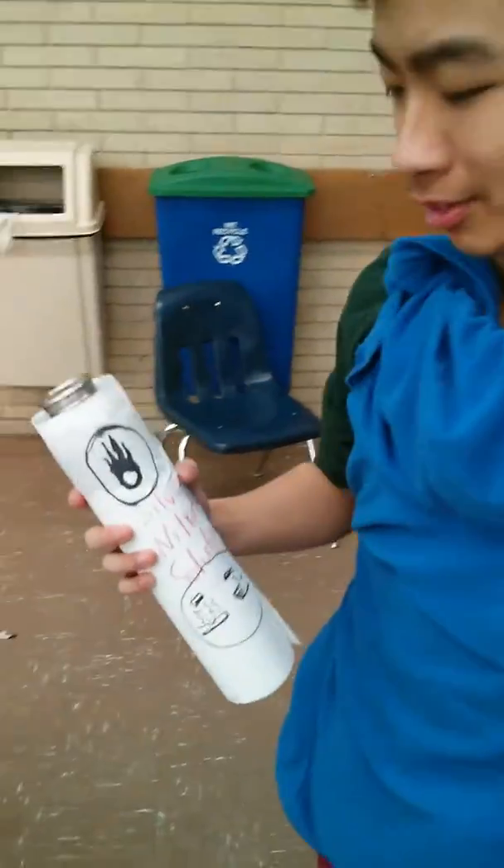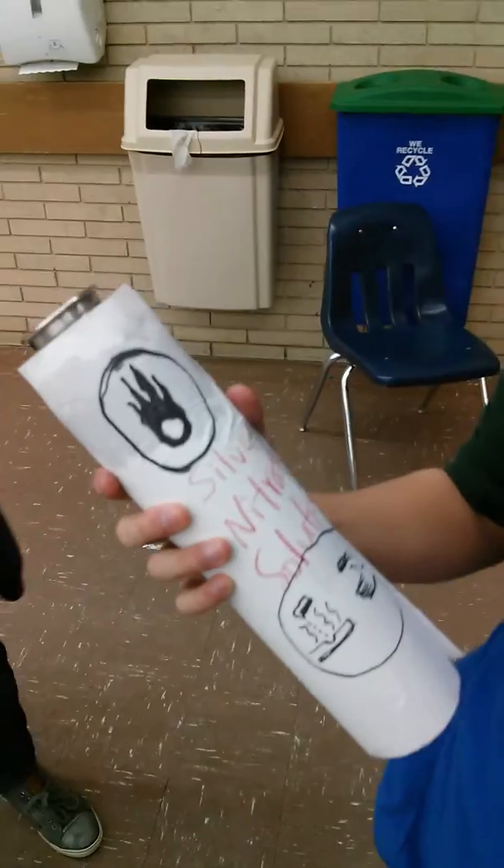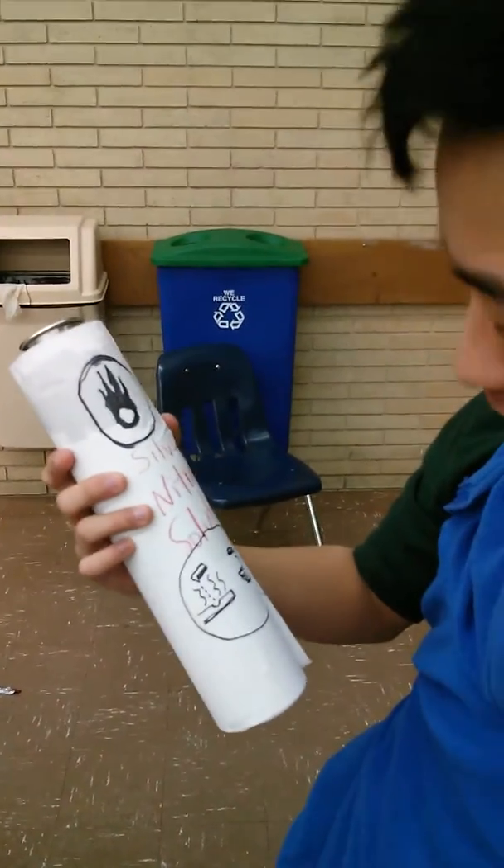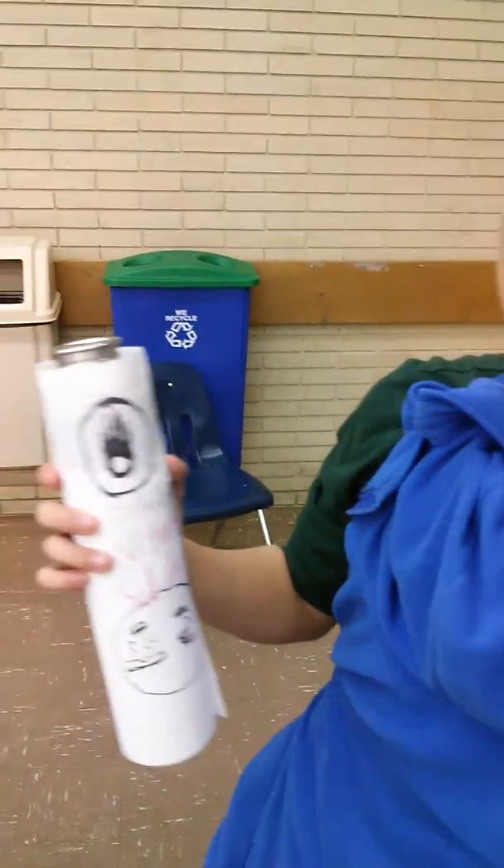Hey Jasper, what you got there? Oh, this is some silver nitrate solution. I'm in chemistry class and this is what we're doing. It's both oxidizing and corrosive.